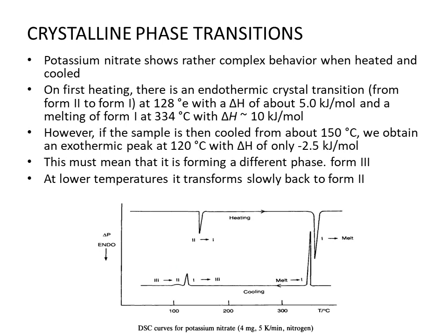And further, at lower temperature, it transforms slowly back to form 2. So this is talking about this one. If we cool it further, it is converted into form 2 here.